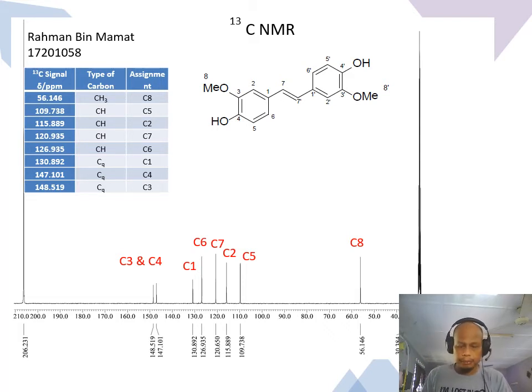For the carbon-13 signal from this compound, we can detect about 8 signals. This compound has a similar chemical shift from this one to this one.